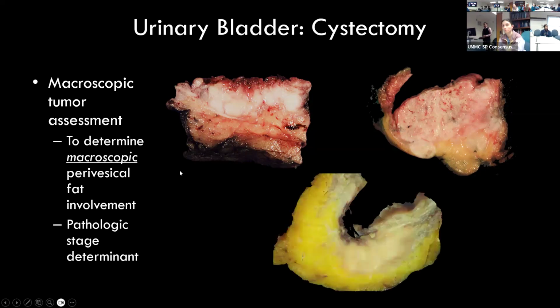How about in difficult cases? So in a case like this, you can see that there is clearly tumor here, and it's different from the muscle bundles, which is here. It's sort of shiny, slightly whitish brown. And then if you track the muscle bundle on this side, you can see there is the same sort of brownish tiny structure over here, and it's interrupted over here.